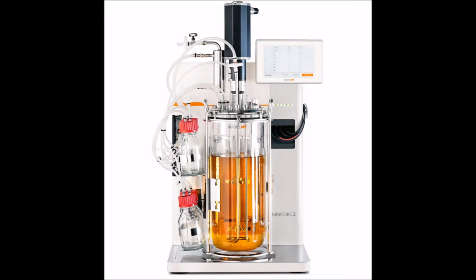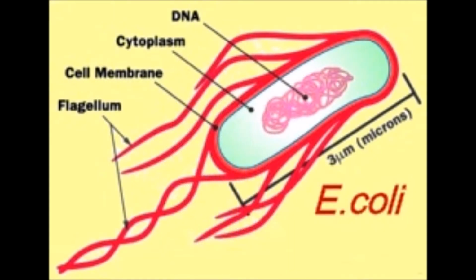In the bioreactor lab, a particular strain of E. coli was cultured in a bioreactor and with inoculated flasks on a benchtop shaker. The purpose of this experiment was to compare the growth parameters in TSB media versus M9 media. Samples were taken in liquid form from each vessel and analyzed for optical density in a spectrophotometer.